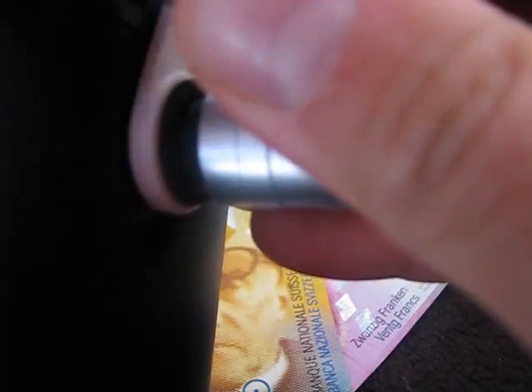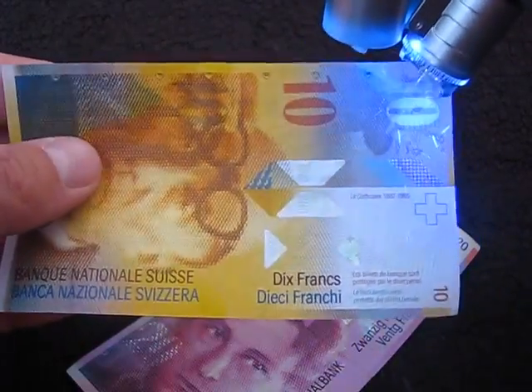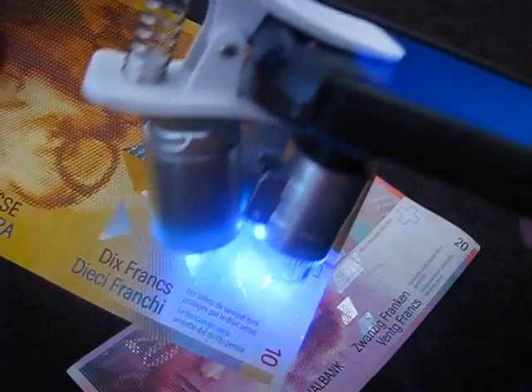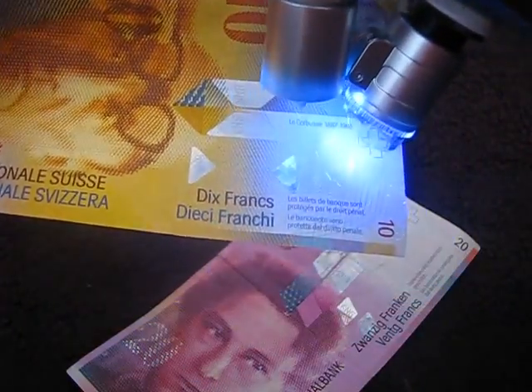Let's check the currency detector feature. I have to change the light to the UV type. As you can see, here are the UV-sensitive ink markings — a small section of safety printing on the currency.